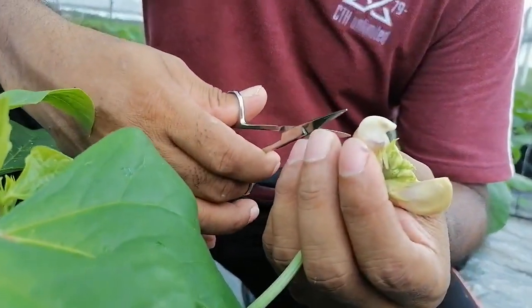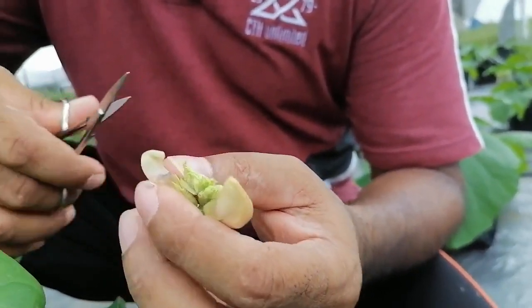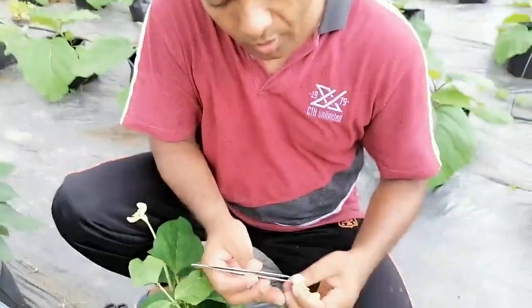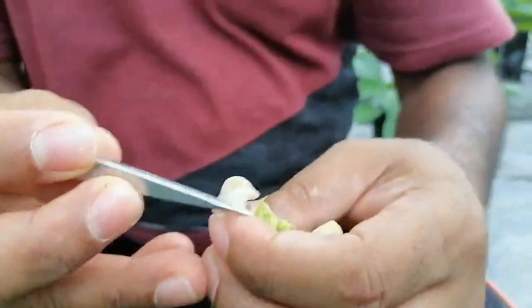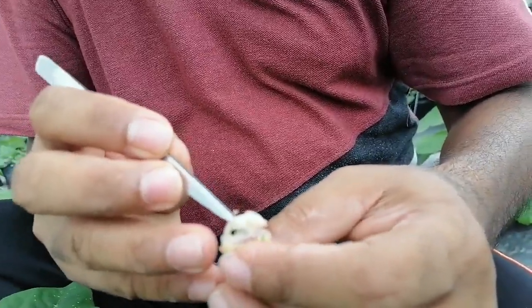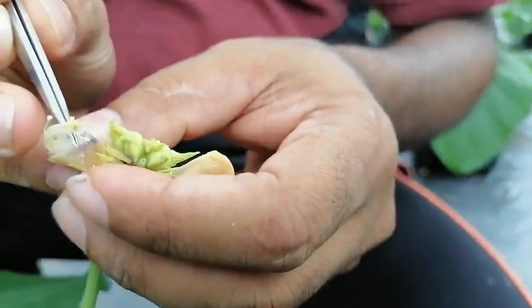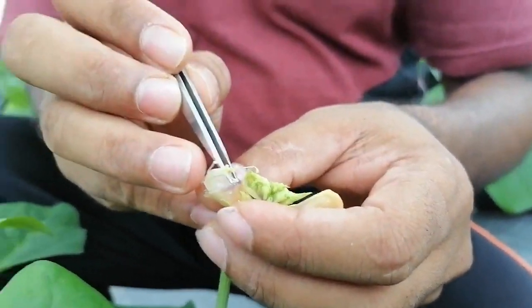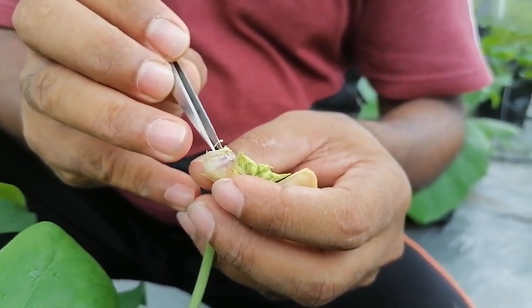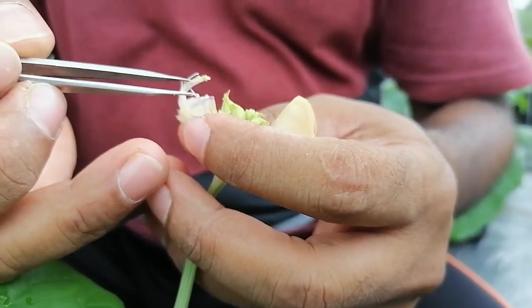After removing the petals, you can see the anthers covering the stigma. The special characteristic here is a nine-plus-one anther arrangement — nine anthers are fused together and one is separate. Using a sharp needle, remove the remaining petals, and then very carefully remove the anthers one by one. You must not damage the stigma while doing this.